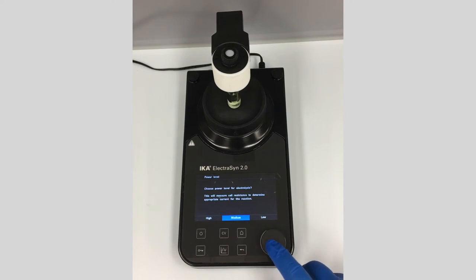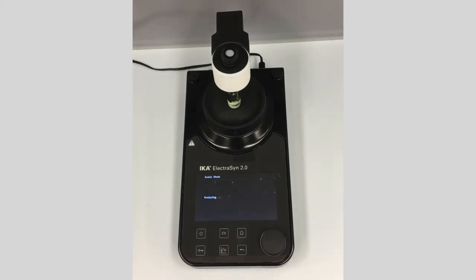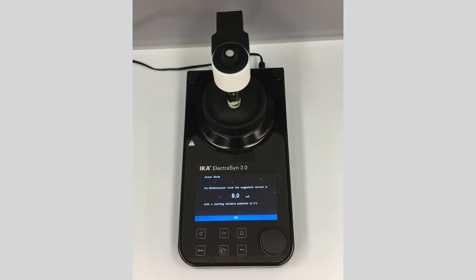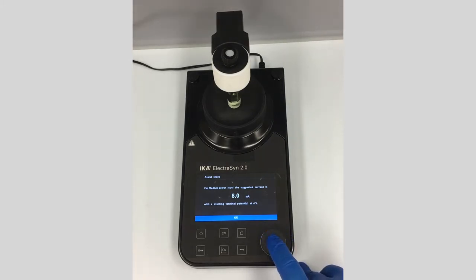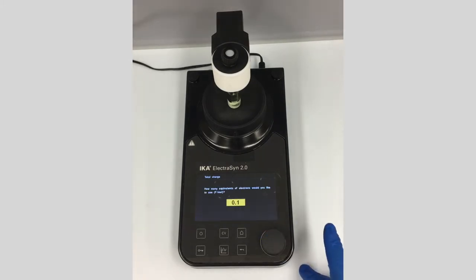We're going to analyze again using the initial 4-volt terminal cell potential, and it's going to give me reaction conditions in terms of current. That's starting at about 8 milliamps, which is a little bit high. Let's run that anyway, so we're going to click OK.